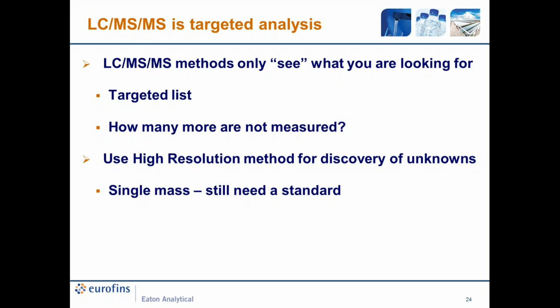I say this because new method development needs to be able to find and rapidly adapt to changing analyte lists and lowering detection limits.